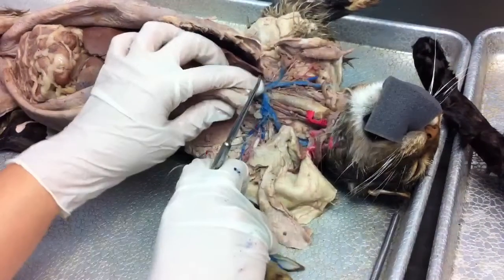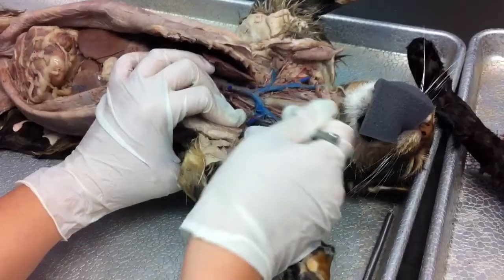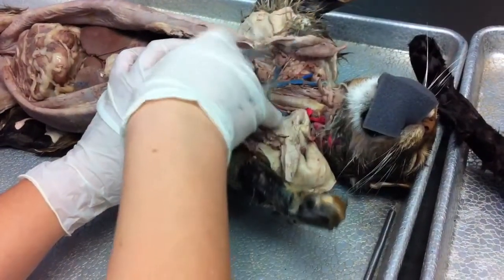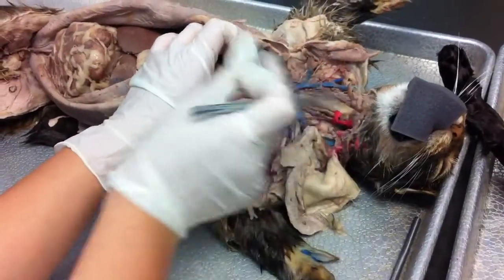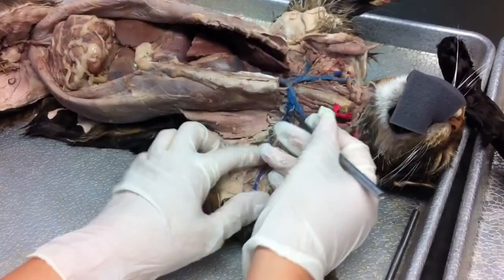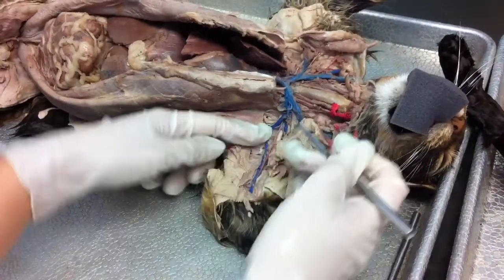And these subclavians, when the cat's actually walking around being a cat, this subclavian vein is actually inside the chest cavity. Okay. But when we dissect them, we cut away part of the rib cage and we pull it out and we stretch it out so it actually kind of comes outside. Okay. But this is the left subclavian.